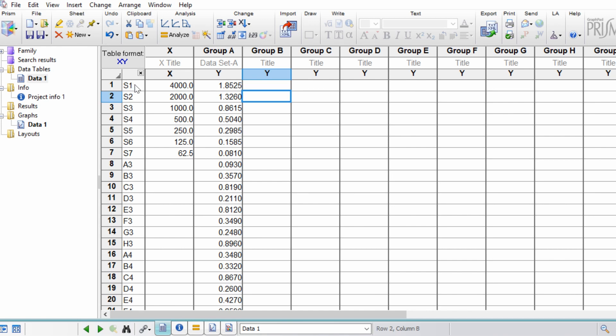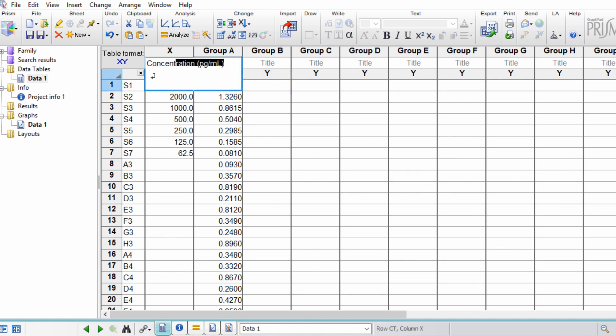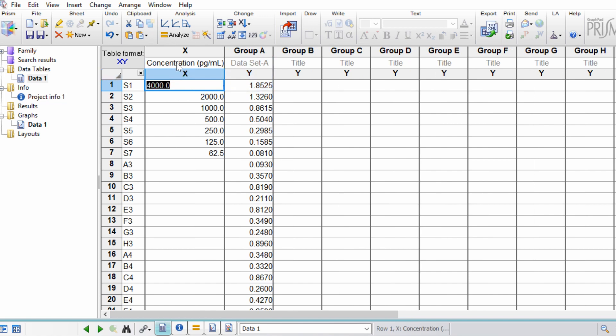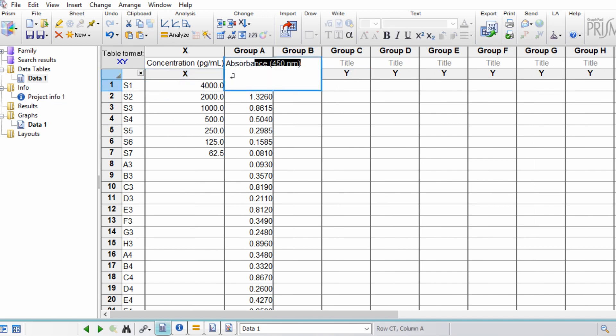So my standards I've just done S1 to S7, and then after this are all my samples. For the X values, these are the known concentrations, so I'm going to type in concentration, and this is in picograms per milliliter. Under group A for the Y values, these are the absorbance values at 450 nanometers.